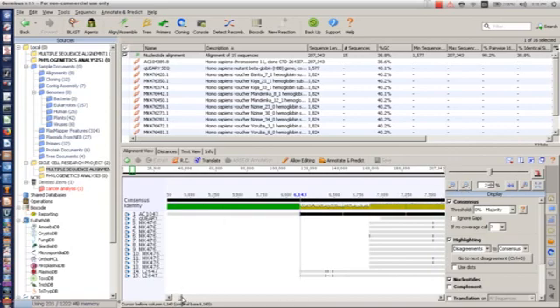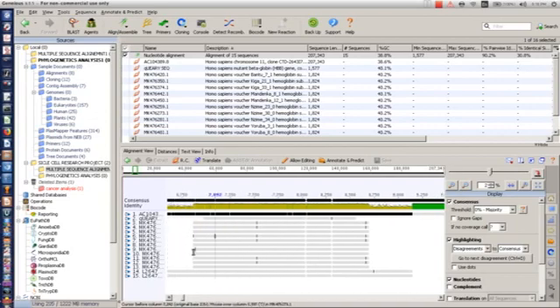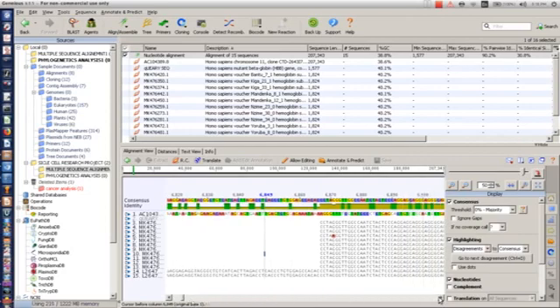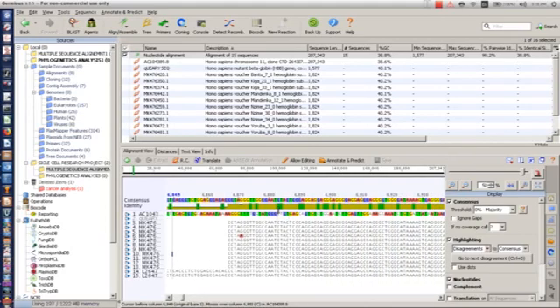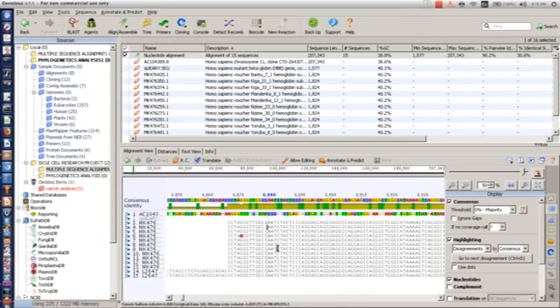So actually, as you can see, this area shows the whole of those sequences. This area we've been talking about actually doesn't have any similar sequences with the others. Only these places. So as you can see here, this place is actually conserved because we have CT all over, just like what I was saying. So they are only conserved here, but here it's not conserved, not conserved at all in a way. But this is actually conserved. So this is also conserved, as you can see.